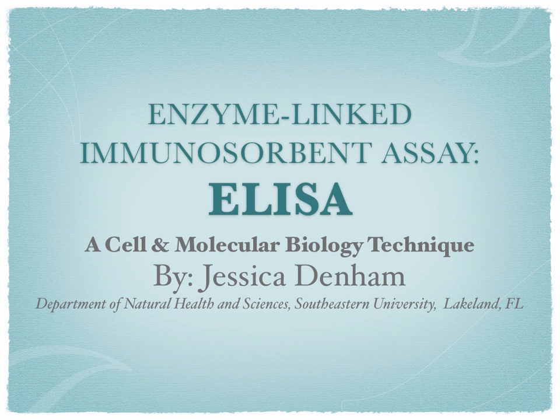I will be presenting for you a cell and molecular biology technique called Enzyme-Linked Immunosorbent Assay, and commonly referred to as ELISA. This presentation is from the Department of Natural Health and Sciences at Southeastern University, located in Lakeland, Florida.